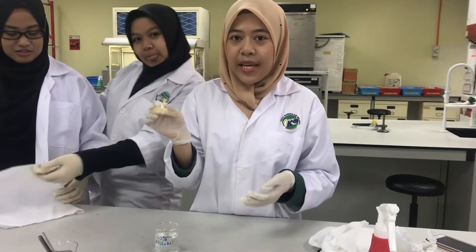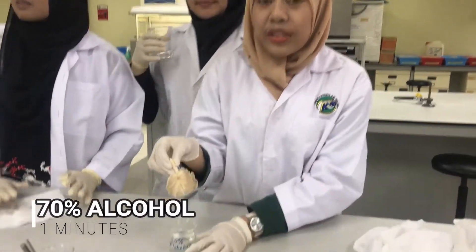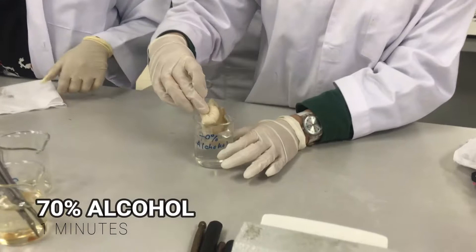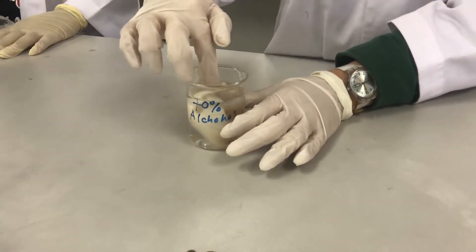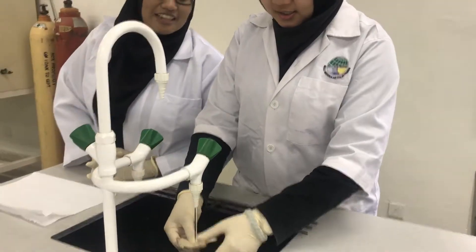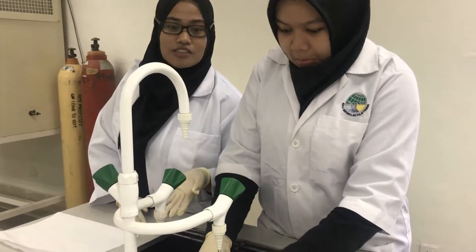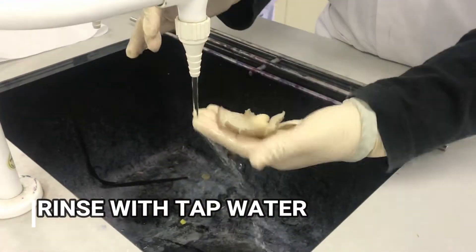For the next step, we are going to put the mushroom to the side of the table for one minute. For the first step of this experiment, we will rinse the grey oyster mushroom with tap water and we will blot it dry.